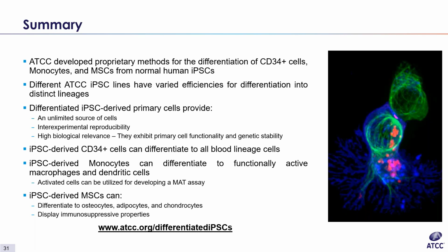Okay, there's a question about transfection here. If we generate our own protein constructs that have our own generated mutations, how do we transfect iPSCs or differentiated cells with our constructs? So that's a good question. Presumably these cells are transfectable. I can tell you that the parental cell lines are.